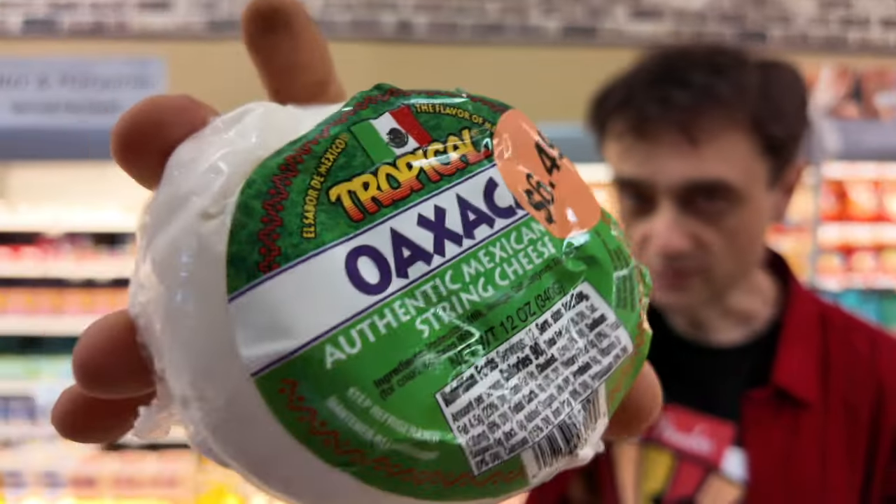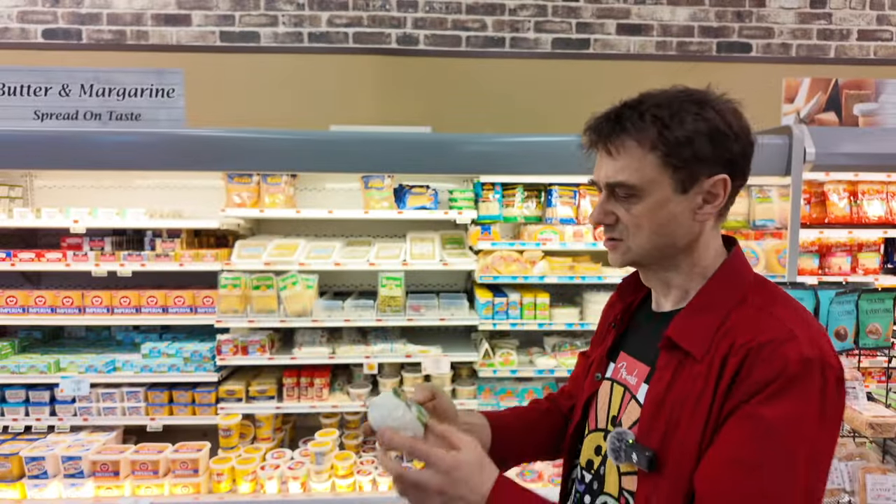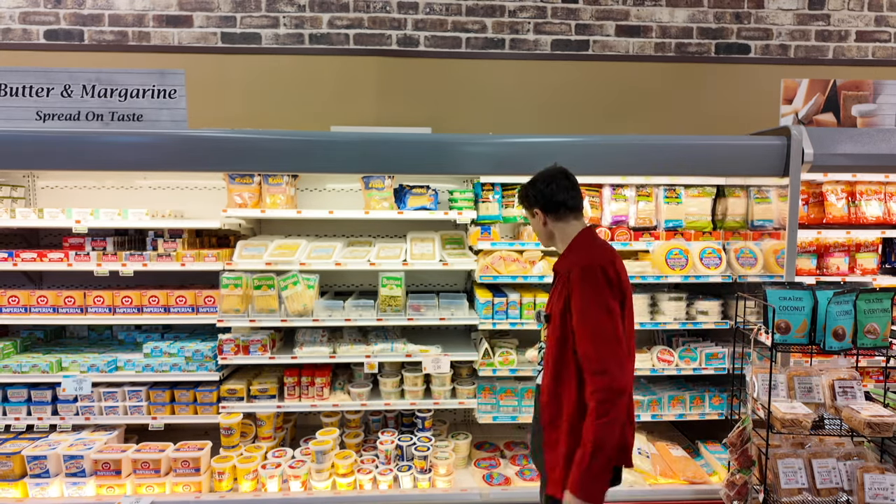This is string cheese. It says authentic Mexican string cheese. It's a dairy product. You can buy it at a supermarket. It's delicious, unless, of course, you have a dairy intolerance.